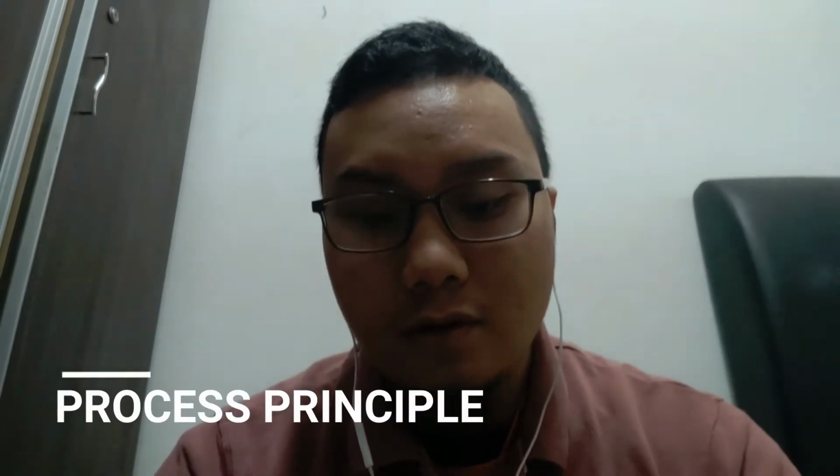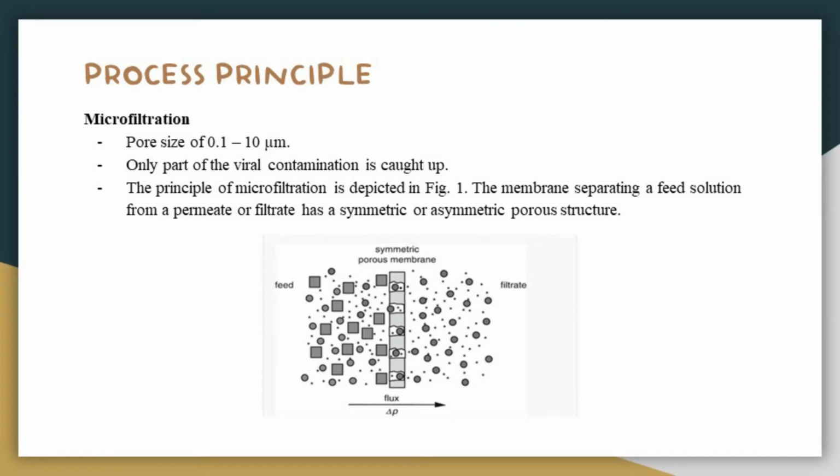So microfiltration, the pore size ranges from 0.1 to 10 micrometer. So only part of viral contamination is caught. The principle of microfiltration is as in figure 1: the membrane separates a feed solution from a permeate or filtrate and has a symmetric or asymmetric porous structure.